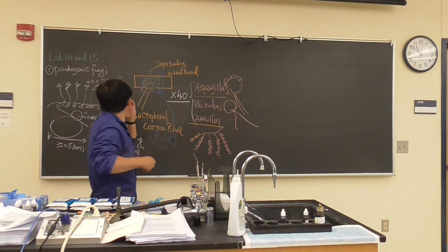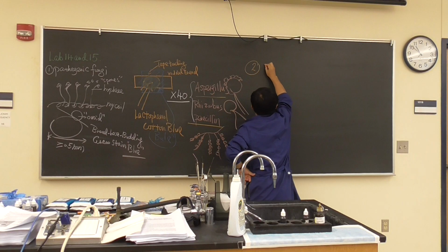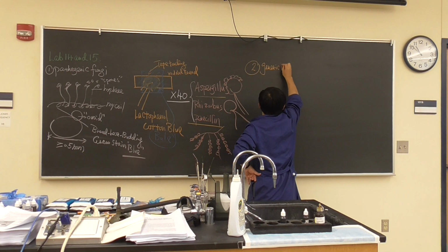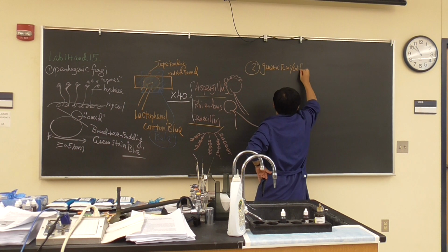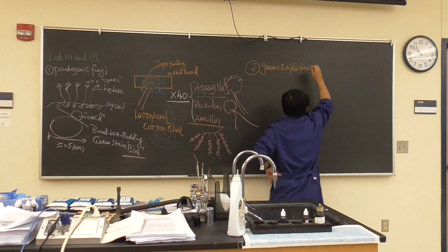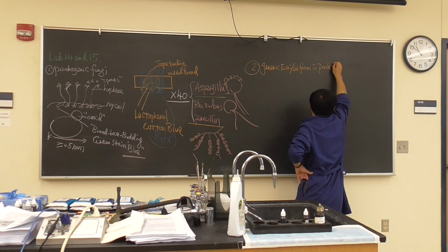The second job we want to talk about is generic E. coli and coliform analysis in pond water.